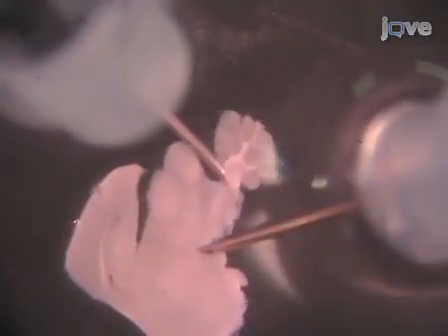Working under the dissecting microscope, use 2 insulin syringes with small diameter 28 gauge needles to separate the cerebellum from the rest of the brain. If any of the slices have superglue on the edge, use the 2 syringe needles to remove the glue from the slice.